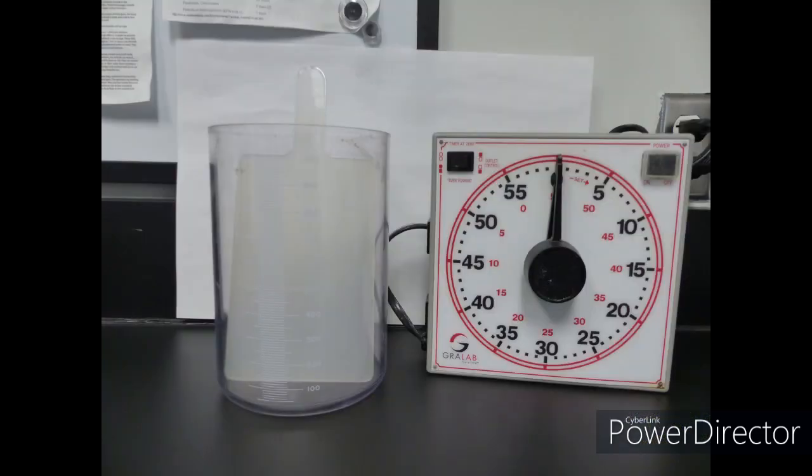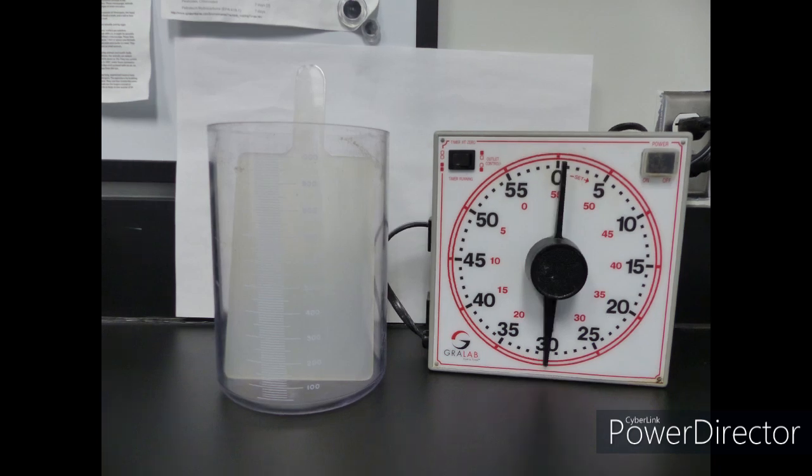Now we are ready to perform the test. For this test, we will be allowing 30 minutes of settling time and noting the sludge level at both 5 and 30 minutes. It is important not to shake or violently mix the sludge prior to the test. Doing so will break up the sludge flock and give false data.